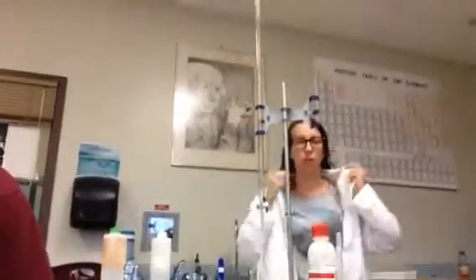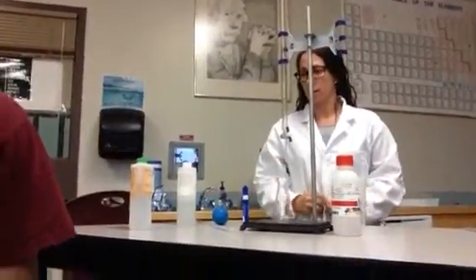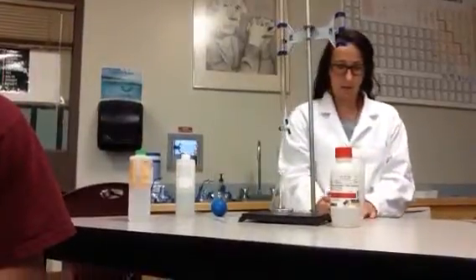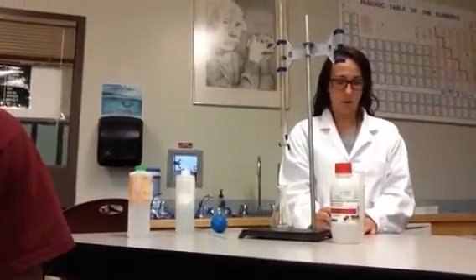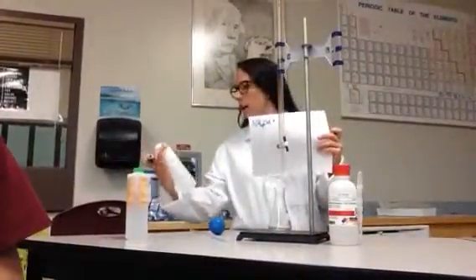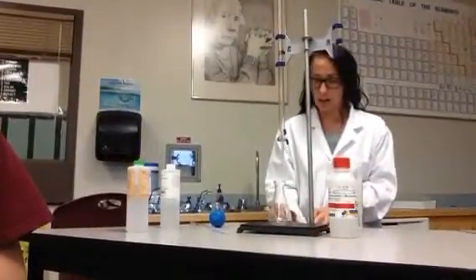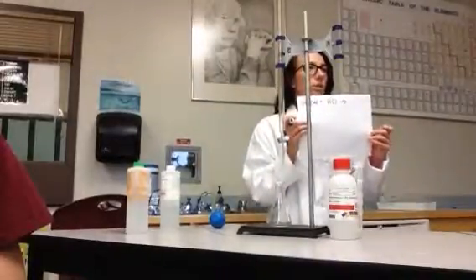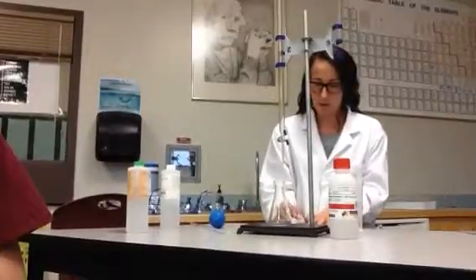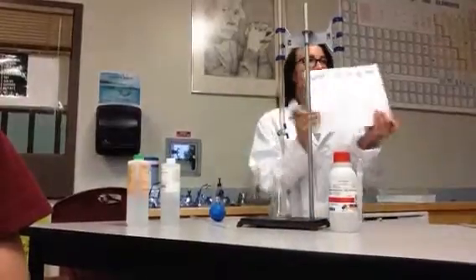This is called a titration. What I'm going to be reacting is ammonium hydroxide. So what's the symbol for ammonium hydroxide? In fact, I'll write it on this. NH4OH. And I'm going to be reacting that with hydrochloric acid, HCl. And I should produce water, H2O, and NH4Cl, salt.